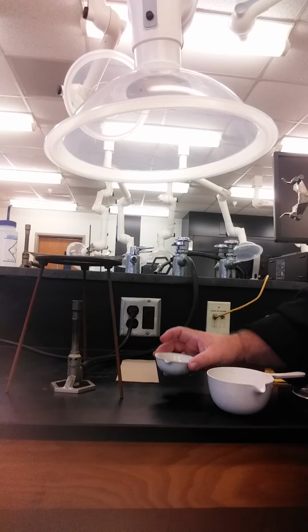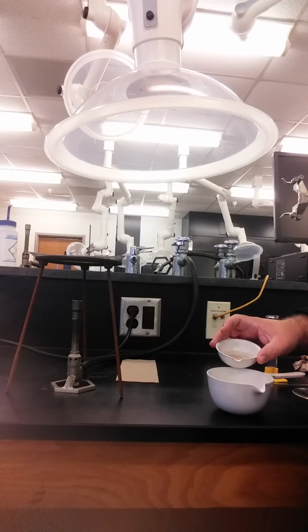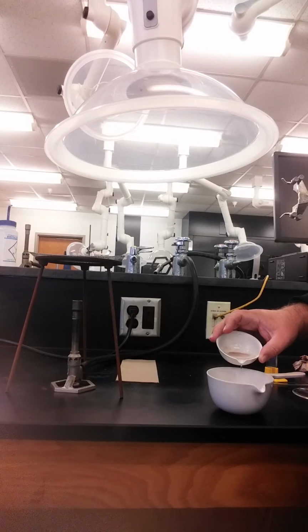To decant the sodium chloride solution, we will very gently pour it from the smaller dish into the larger pre-weighed dish. The goal here is to leave all of the silicon dioxide in the first dish while transferring as much of the water as we possibly can to the second.